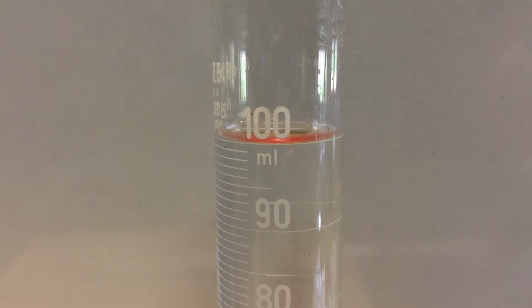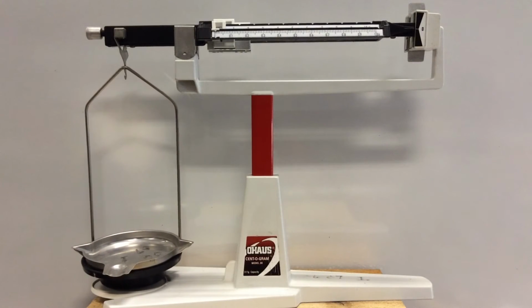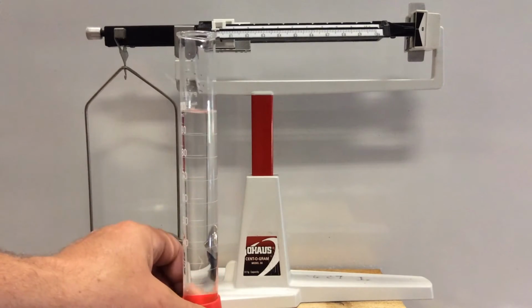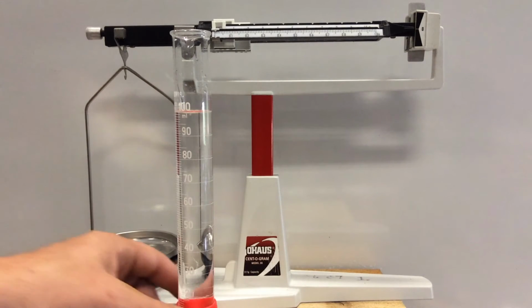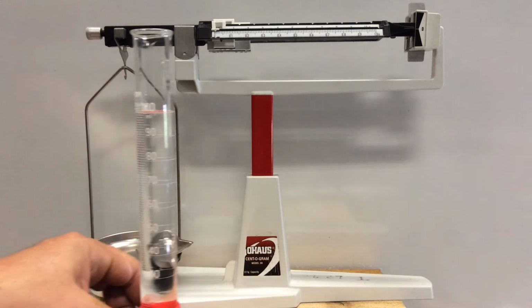In the lab you see it's written there, but that's important as I'm going to have you measure for me on a test. So now we're going to measure the water, and we're going to measure the mass of the water. We have the known exact volume. We have our 100 milliliters, 100.0 milliliters, meaning the 100.0 is telling me that I have a measurement device that was calibrated to the single individual integers. Remember, that significant figure is so important as we go through the entire course and into AP.